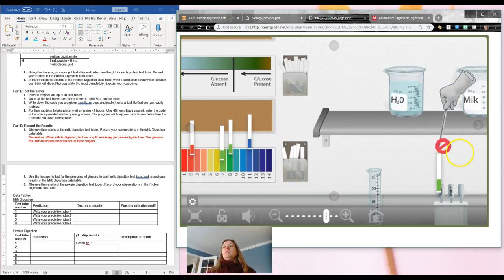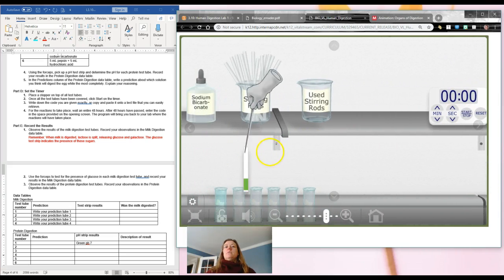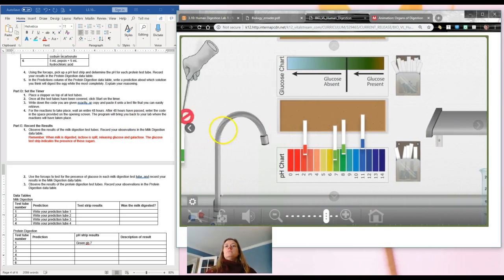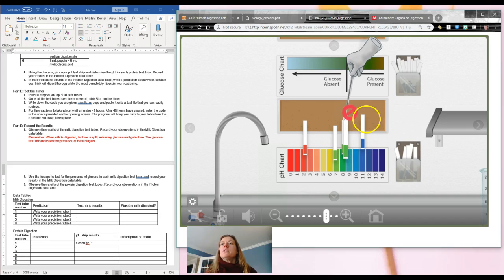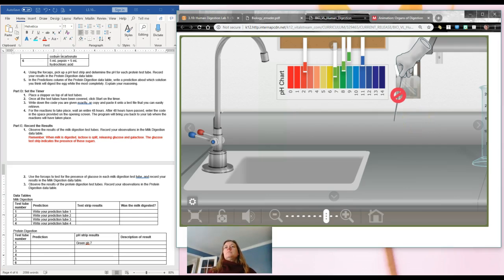All right, pick another one. Fifth one. Wait, blew past it. 1, 2, 3, 4, 5. Looks like it's still green. It's much closer to 8 this time. All right. So it's 1, 2, 3, 4, 5.